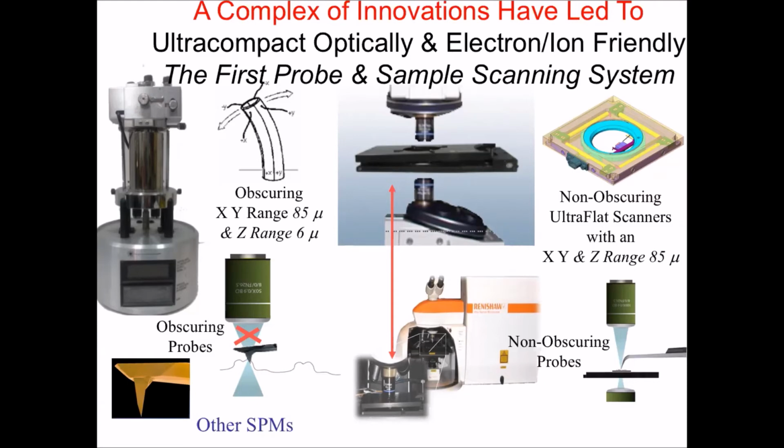There were other issues, okay? So I showed you this piezo, and I showed you that it was not integrated into optical microscopy. Not only was it not integrated, but all the probes that people used, except for one, essentially block light from the top. So if you have, let's say, a tissue sample, which is very scattering, okay, you couldn't see it.